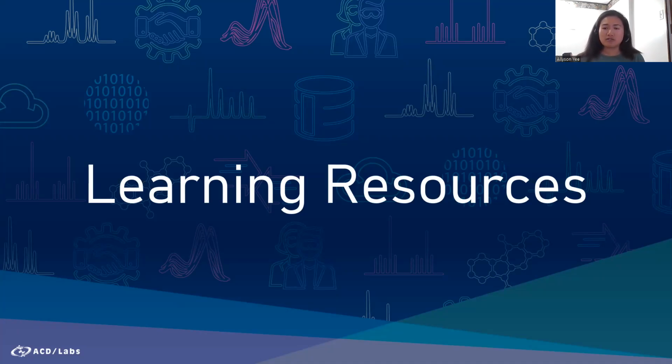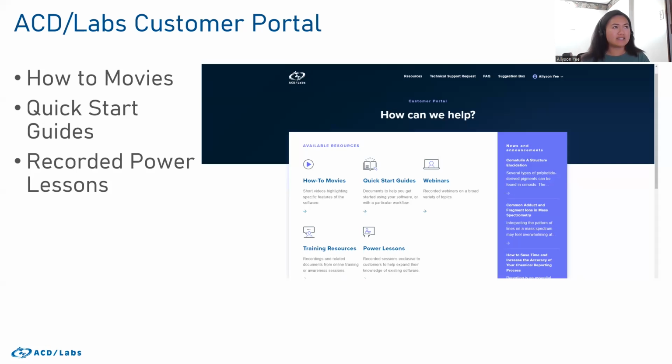So what learning resources do we have when it comes to learning about ChemSketch, and how can we get started with it? So the first place I'd like to highlight is the ACDLabs customer portal, which I just mentioned. So on the customer portal, you'll find how-to movies. These range anywhere from 2 to 5 minutes long, I would say. These teach you specific tools to use within the software. So we have a lot for ChemSketch specifically.